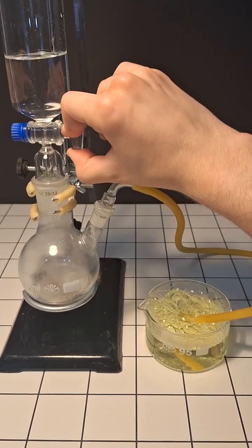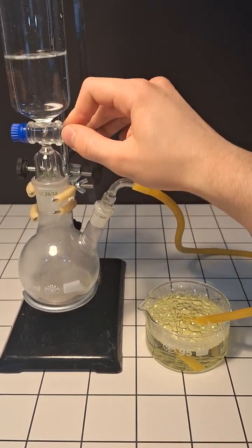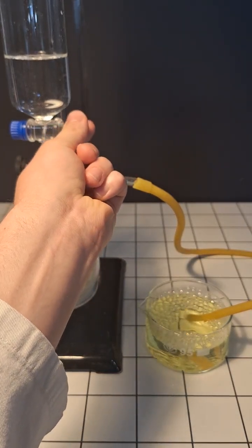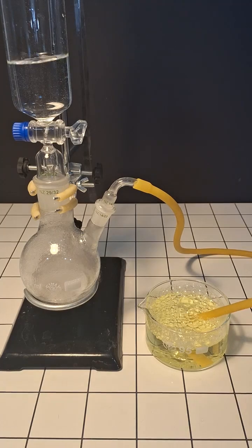We can already see that it's making some bubbles, however these ones are mostly just air which is being displaced from the flask. Now at this point most of the air in the flask should be already displaced by the hydrogen, and the stuff that's coming over should be relatively pure.